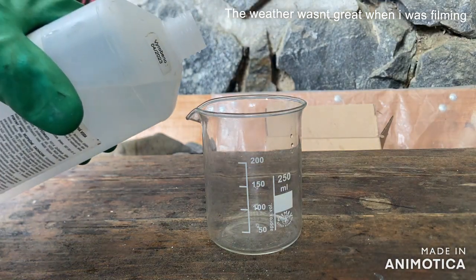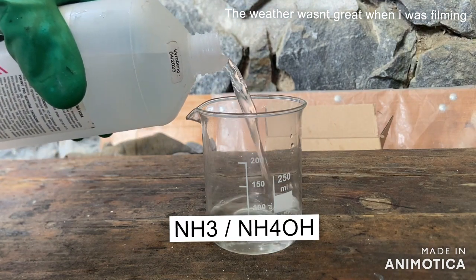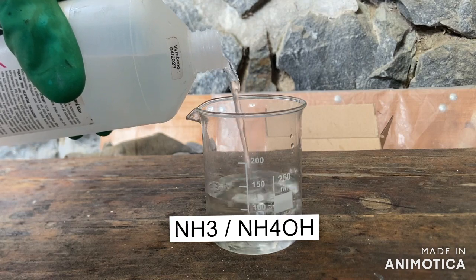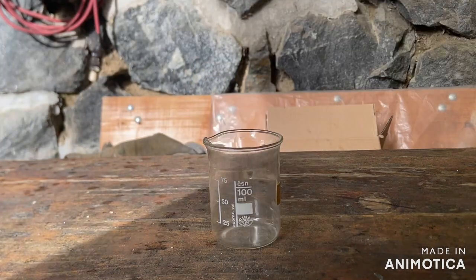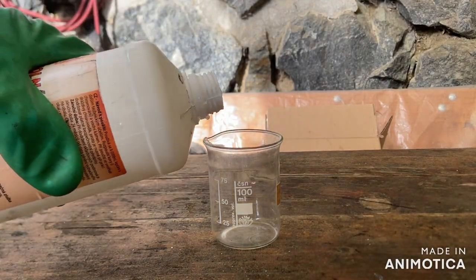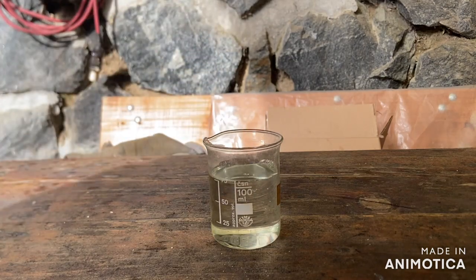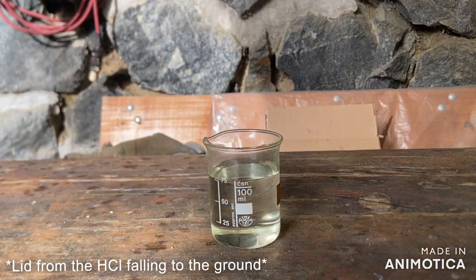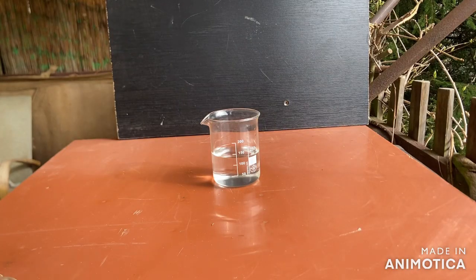Into the first beaker I added around 140 ml of ammonia solution. Into the second one I added a random amount of hydrochloric acid. Now I will add the hydrochloric acid into the ammonia solution until the pH is around 7.